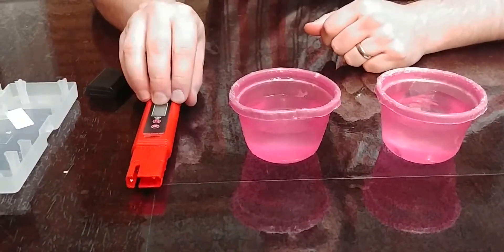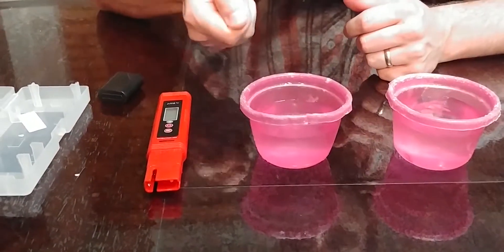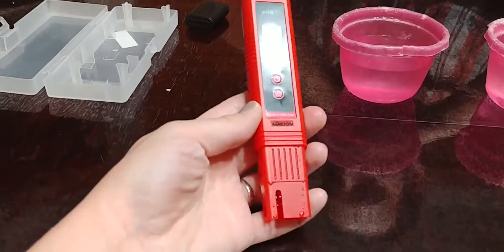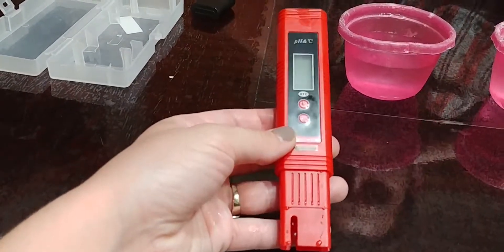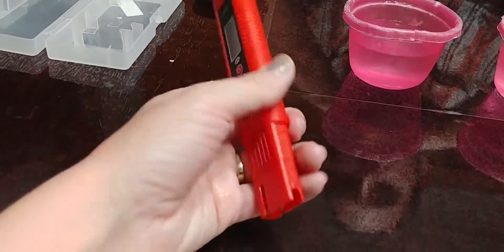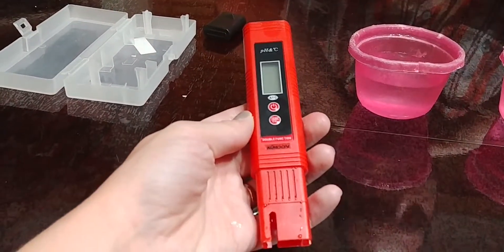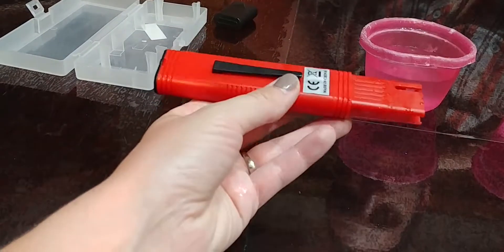It's a nice little tool to have so you don't have to use those little strips you dip in and read the color, or any chemicals. Really simple and easy to operate. It gives you an instant readout of your pH level and temperature — that's all it does, but if that's all you need, this is a simple tool to have.